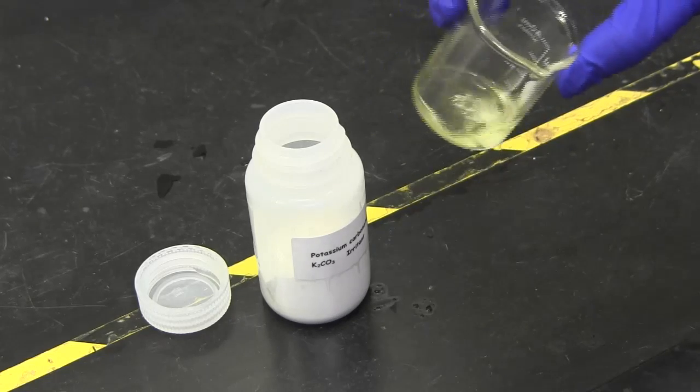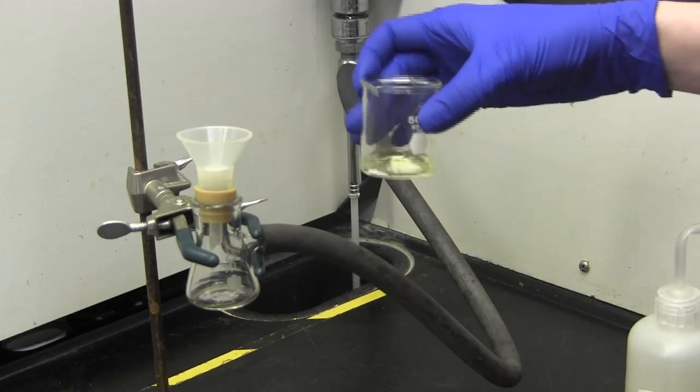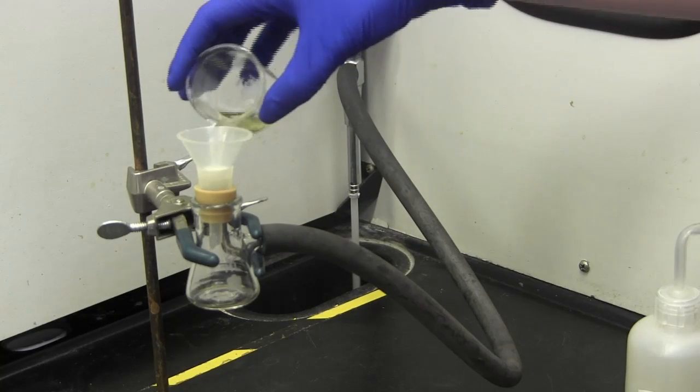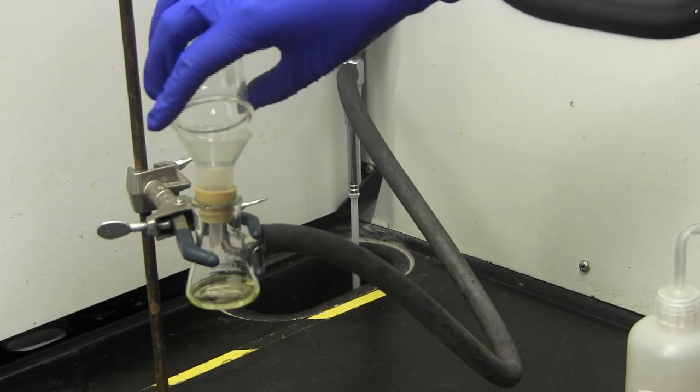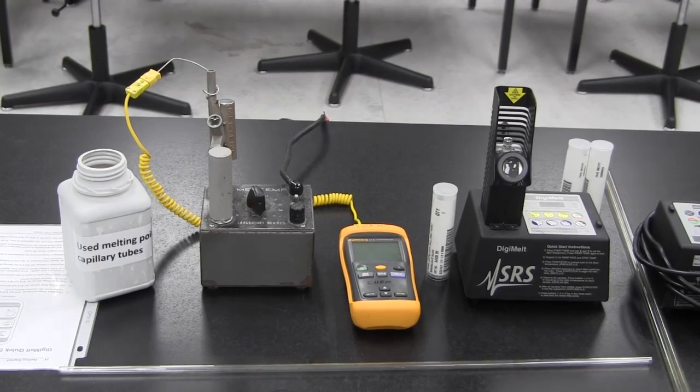You will need to filter the drying agent off using a Hirsch filter. Then, evaporate your unknown solution using a rotary evaporator and transfer it into a wave vial. You will need to obtain IR and NMR spectra, as well as the melting point.